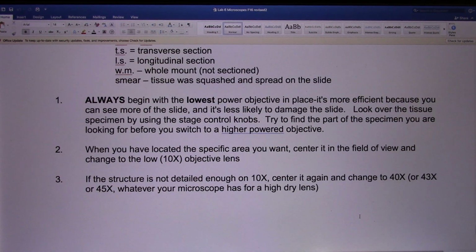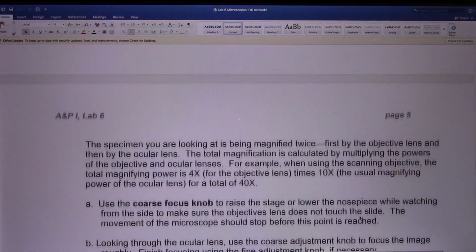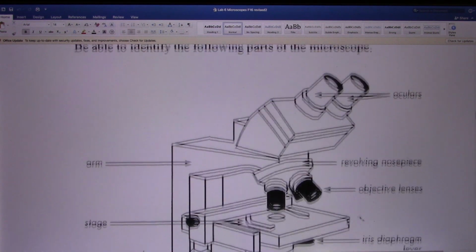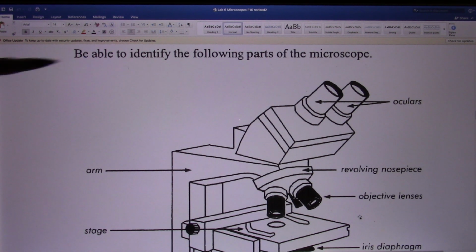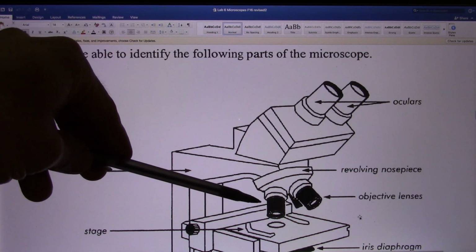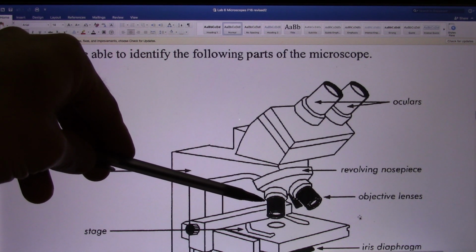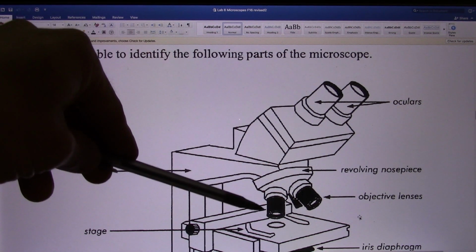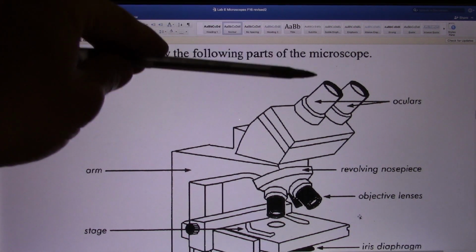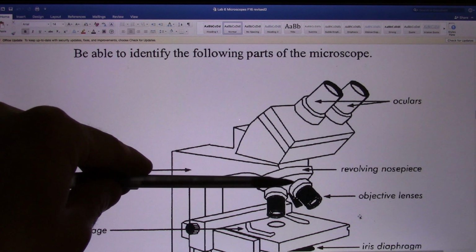And let's look at one more thing: the total magnification. What's the total magnification of the microscope? So if I give you the ocular lens is 10x, multiply signal by 10 times, and I use the 4x objective, could you tell me what's the total magnification? And the answer would be 10 multiplied by 4, 40 times. Yeah, and that's actually the smallest magnification.